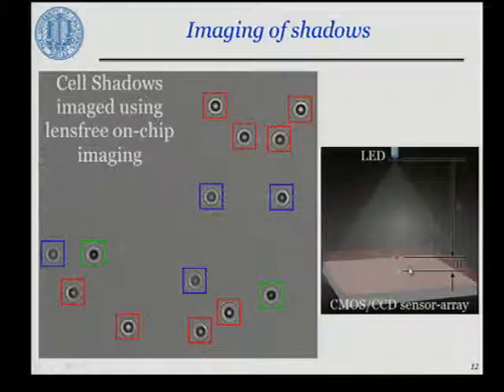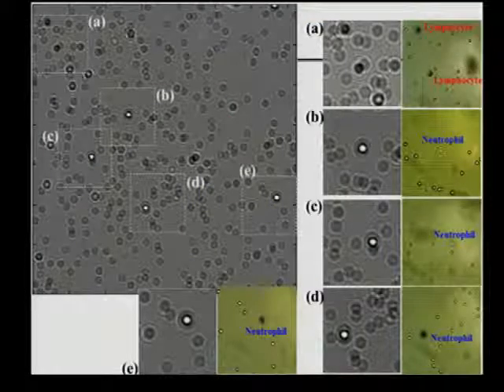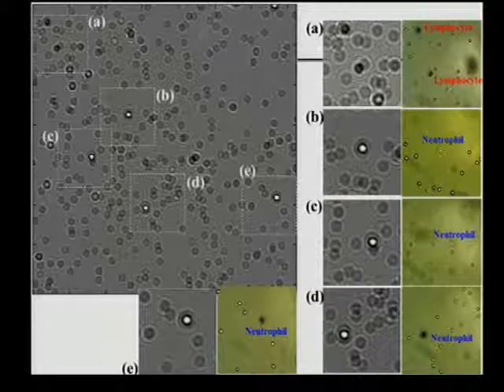And you place the specimen, a sample that can transmit light, very close to it. Typically, H that you see in here is about a few tens of microns to maybe a few millimeters. So it's almost like taking a shadow image of the samples. And if you look at what's happening at the recorded image, you will see these diffraction patterns. These are the shadows, but they are shadows that are quite unique. You can use them as a basis for a cytometer. In this case, you're looking at a whole blood sample.